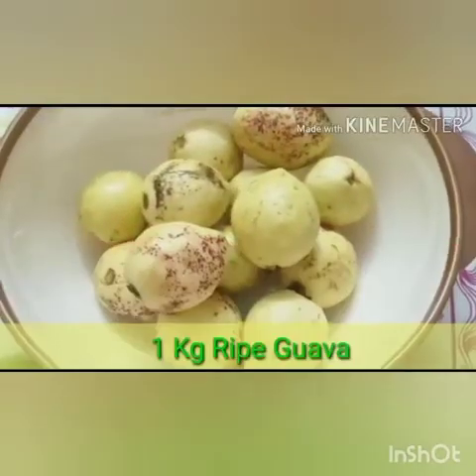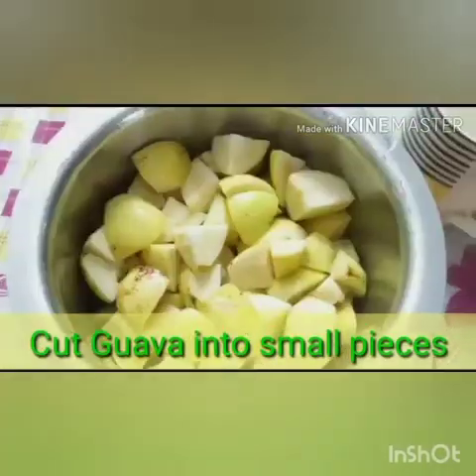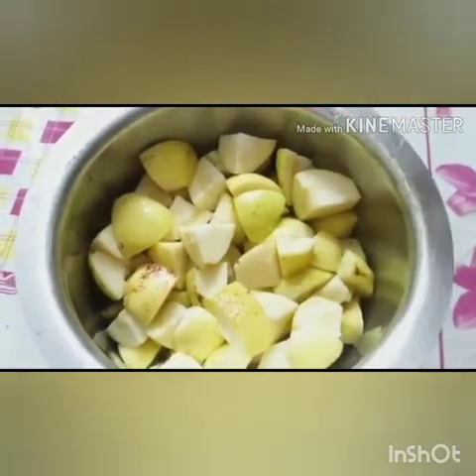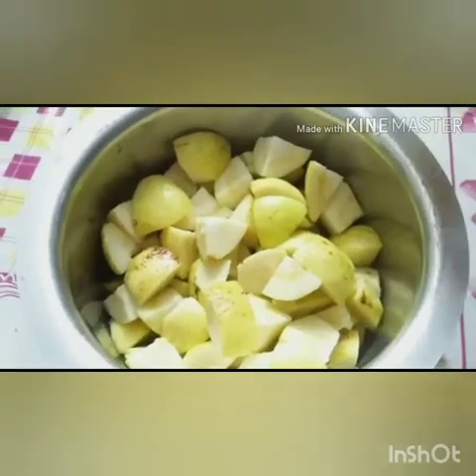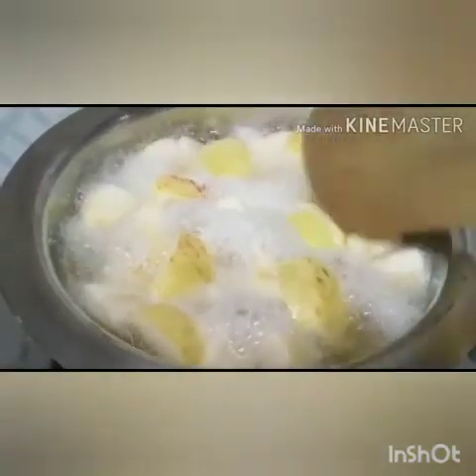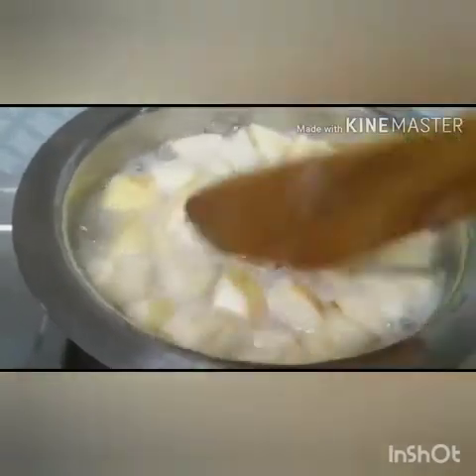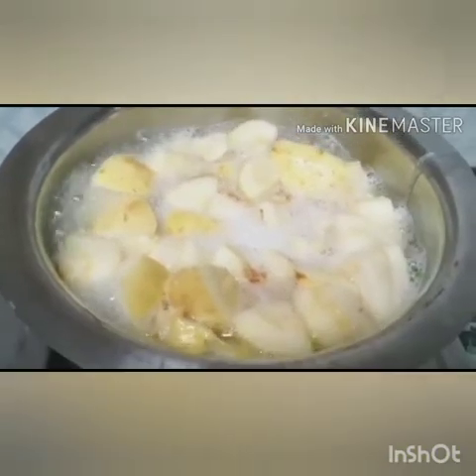Today I will be showing the process of guava jelly making. For this, we will take 1 kg of guava and cut it into small pieces. After cutting, we will add water — the amount of water should be minimum; here I am using 500 ml. Now we will boil the guava. We don't have to boil it to a paste-like consistency; we just want the guava to become tender.